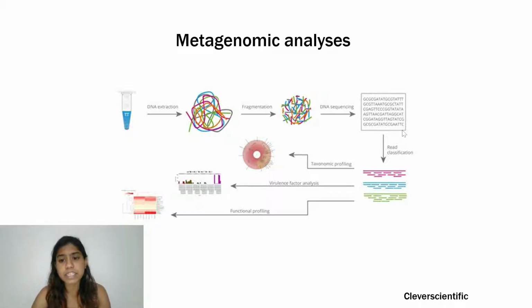And followed by this, there are several techniques we can use for sequencing these fragments. So we'll see how Sanger sequencing is done, and also how the next generation sequencing is done in a couple of slides.